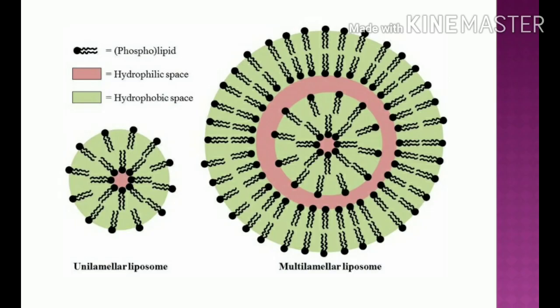The picture of the liposomes is shown. In the case of multilamellar liposomes, the outer membrane will fuse with the plasma membrane and the inner membrane could be impregnated with nuclear proteins so that the inner membrane will fuse with the nuclear membrane, delivering the recombinant DNA into the nucleus.